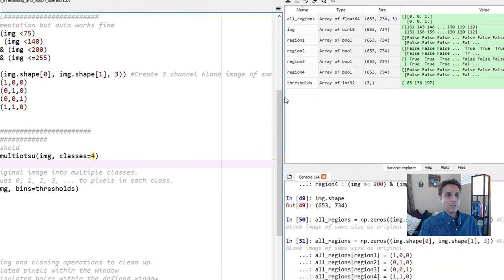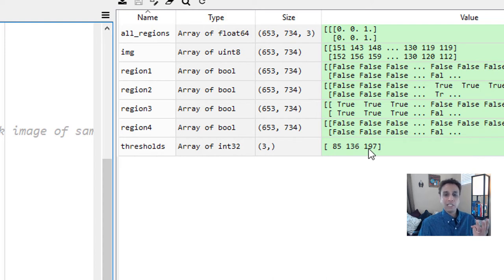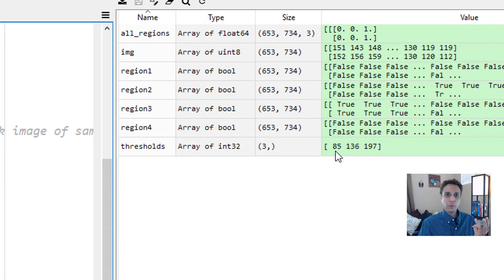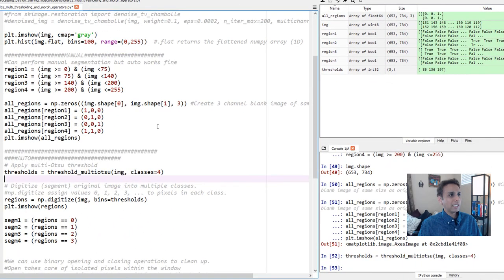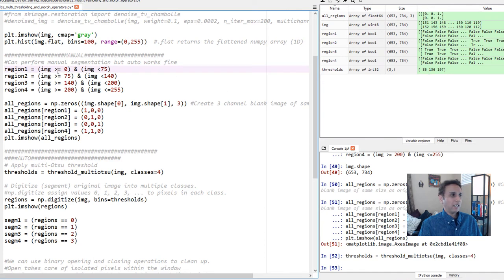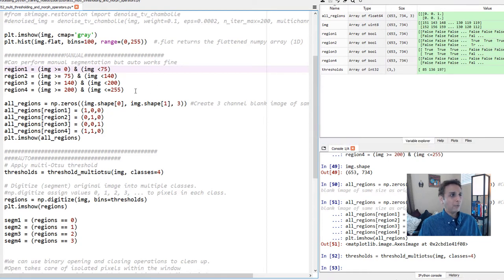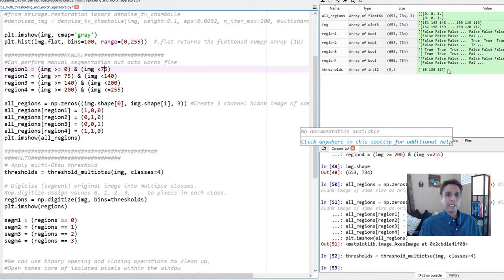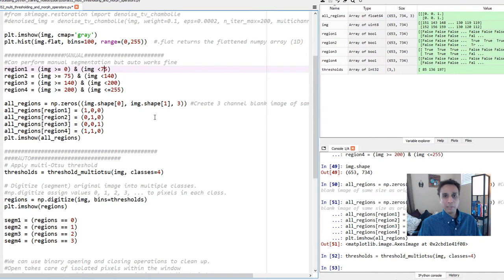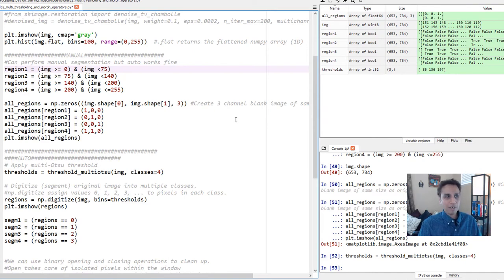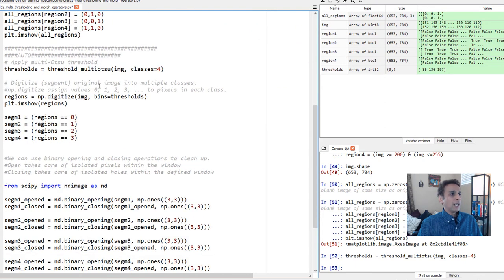It's applying threshold_multi_otsu on our original grayscale image with four different classes. It just divides this into four different regions. We should get three threshold values. Let's run this line. Now you should see our threshold values - three threshold values, 85, 136, and 197. Why only three? Because obviously it's implied that the values go from 0 to 85, 85 to 136, 136 to 197, and 197 to 255. Previously when we looked at the image, we said 0 to 75 - 85, not that bad. And we said 75 to 140 - 136 seems to be optimal. And we picked a value of 200 - 197 seems to be optimal.